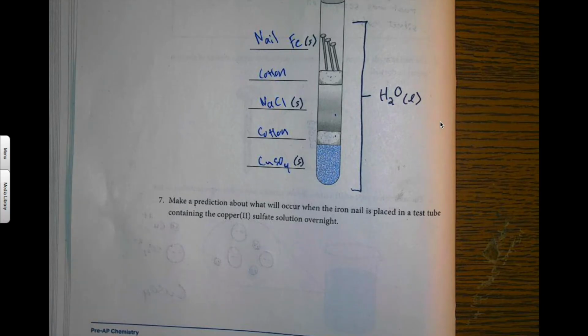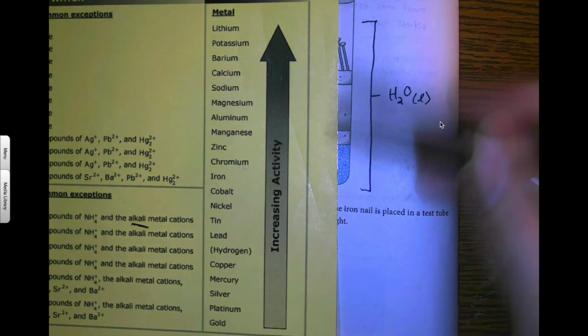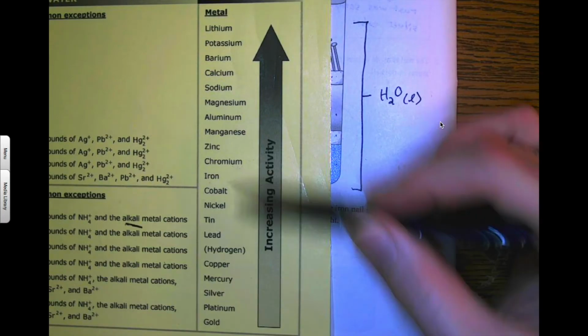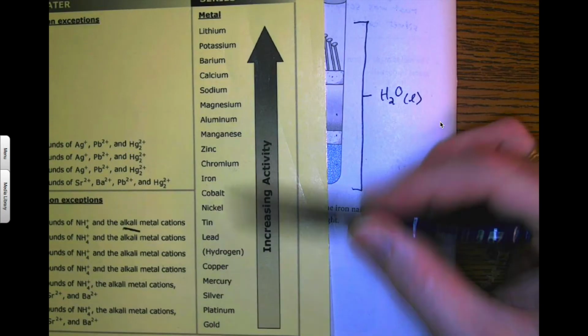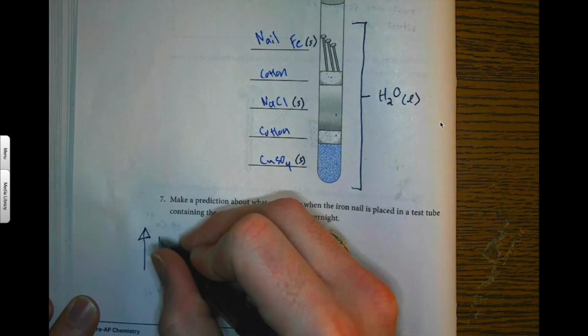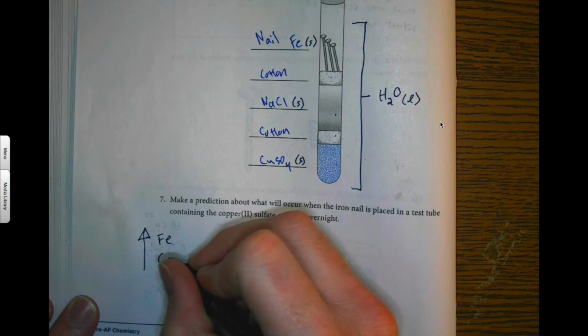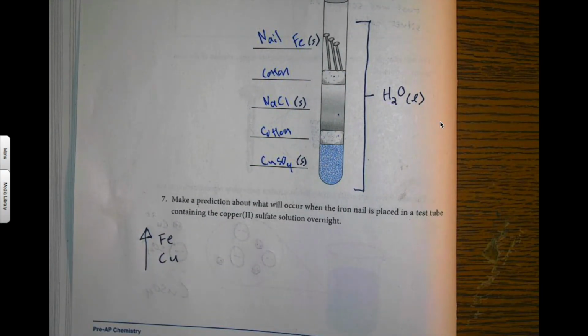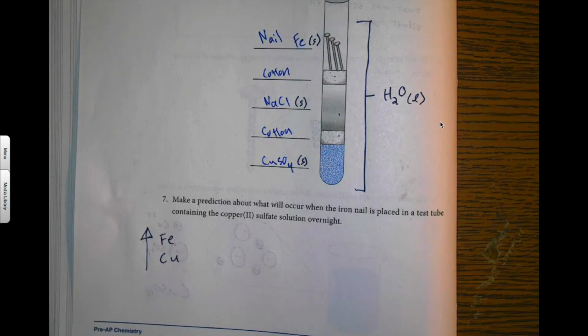Now, you're supposed to be looking at your activity series here. Let's take a look at the iron, and let's take a look at our copper here. So if we condense this activity series, we should find that iron is more reactive than copper. So hopefully you understand. We've been watching the activity series, and we understand that the one on top is the most reactive and is going to end up being an ion.